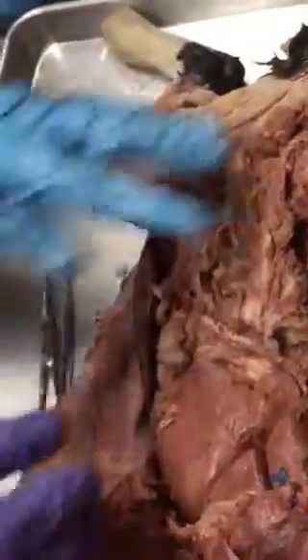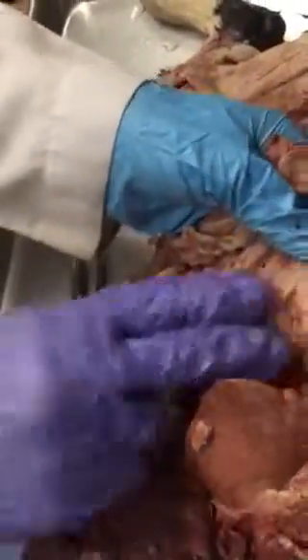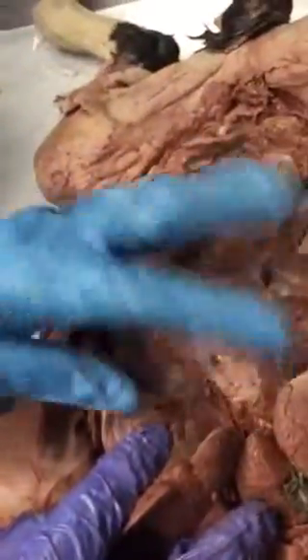Because it's going to be kind of an insulating and protective kind of structure. So you see the spleen over here on the side, and then as you start to lift it up, you notice there's this big kind of sac structure here. That's the stomach. Okay, so the greater omentum is attached to the curvature here of the stomach.